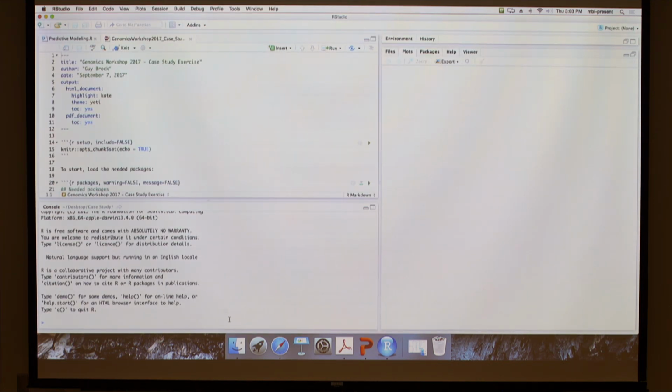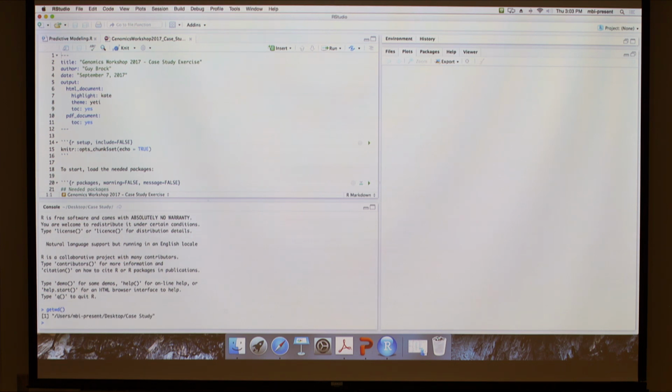And then if you go down here and check your working directory, voila, it starts you up in the directory that you want to be in. So no change in directory, no issues with that, no problems whatsoever. You should be able to then just run the code without having to change anything, really.